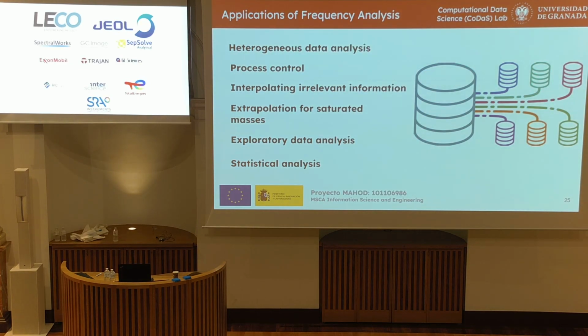Okay, so ultimately, this is heterogeneous data analysis. It opens the door for process control, interpolating irrelevant information, extrapolation for saturated masses, exploratory data analysis, statistical analysis. Imagine, if you will, someone uploads their data to this really, really cool server, and you could analyze your experimental data in the context of other people's experimental data, regardless of differences in column configurations in the frequency domain. That's my dream. So if you're part of that dream, give me money.